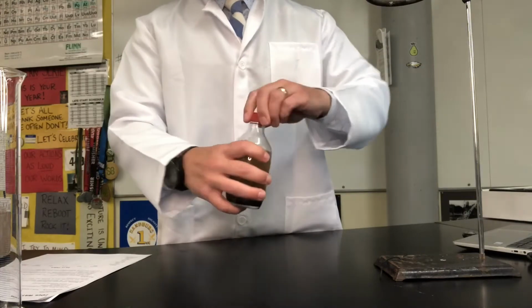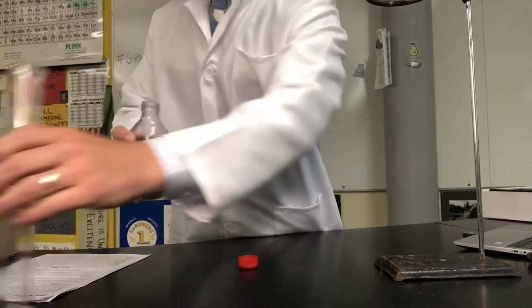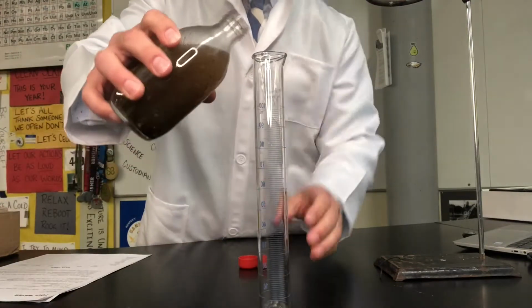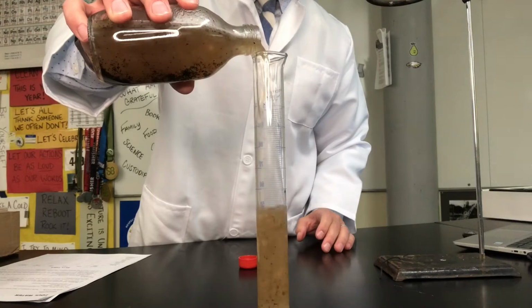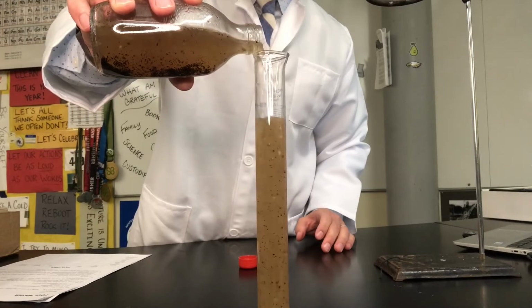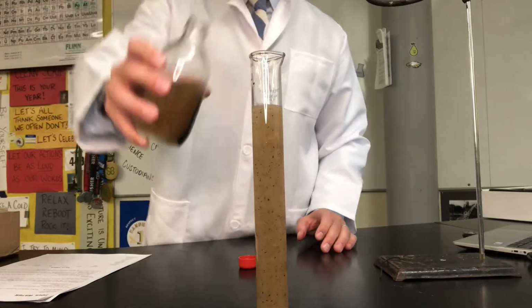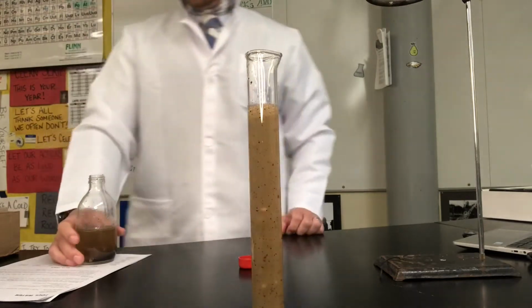So the first thing I'm going to do here is give this nasty water a shake, and I'm going to measure out, like the lab says, about 100 milliliters of this dirty water to start. So we're going to fill up our graduated cylinder. We're going to measure that and make sure that it's at 100 milliliters, which it is.